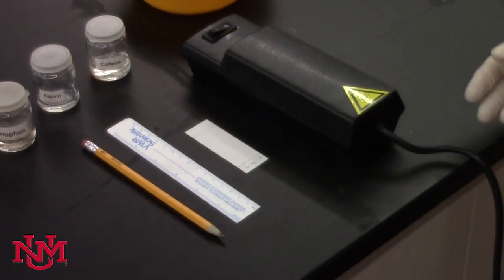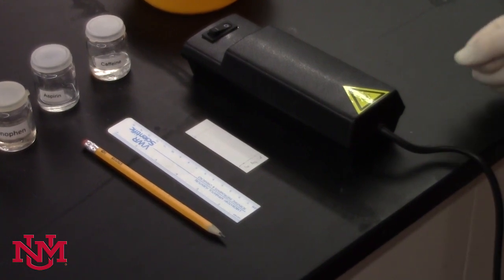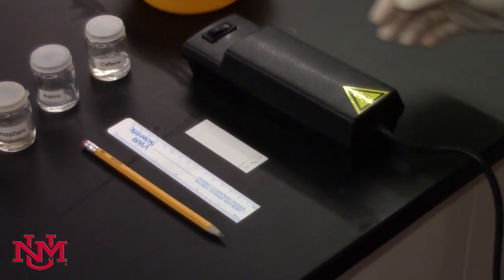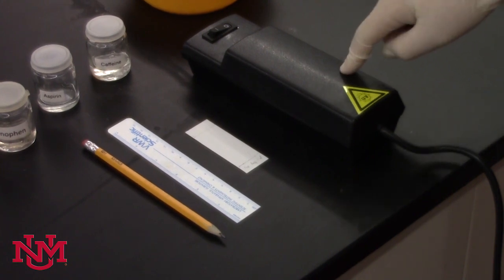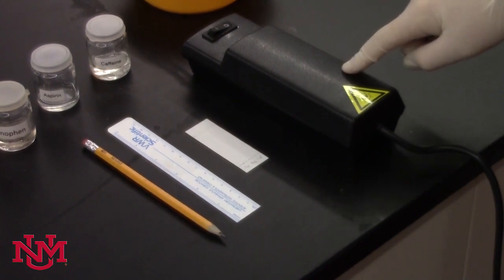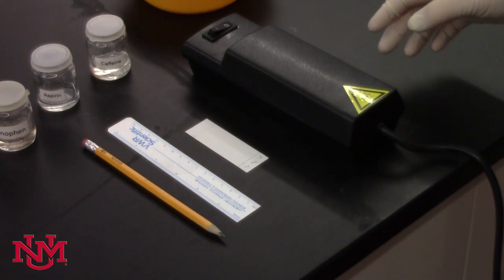We won't be able to tell if our TLC was successful unless we know we transferred sample to our plate. A UV lamp is one way of visualizing a TLC plate.